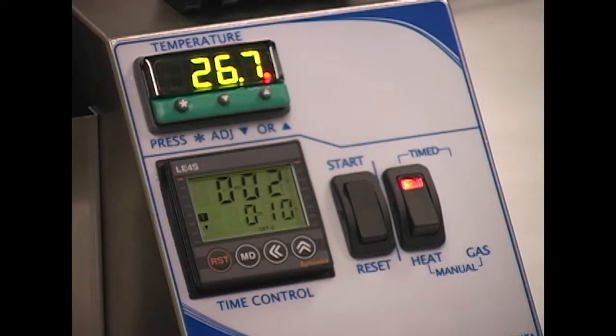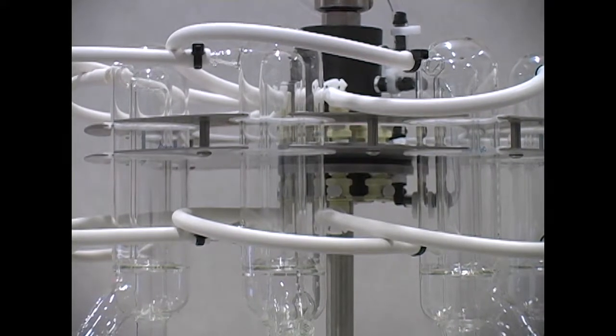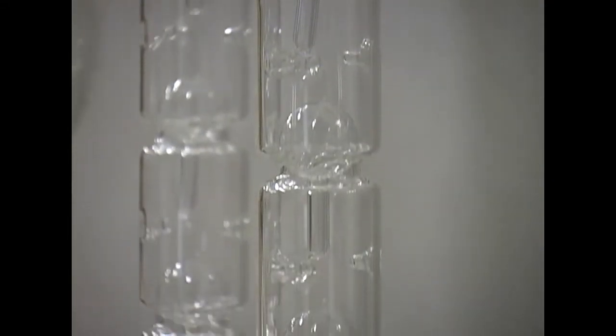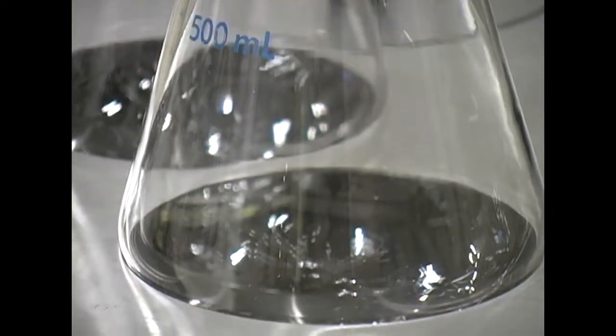The timer function automatically turns the heat off once the evaporation is complete. The condensers may remain in the unit. Hot solvent vapor should be allowed to cool and condense into the solvent flask. This will reduce solvent loss to the environment and help rinse the glassware.